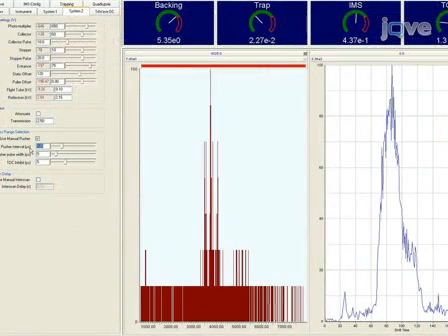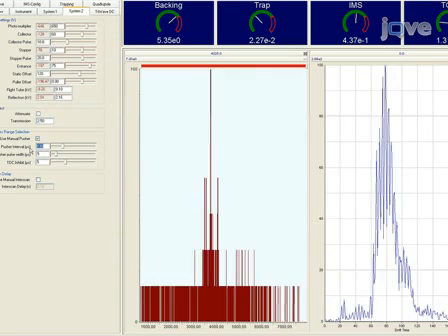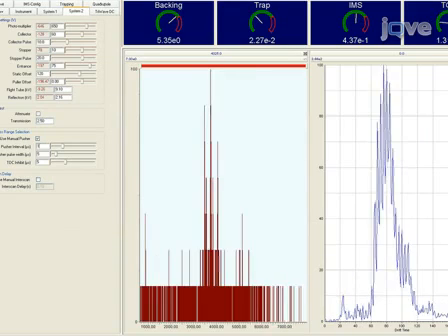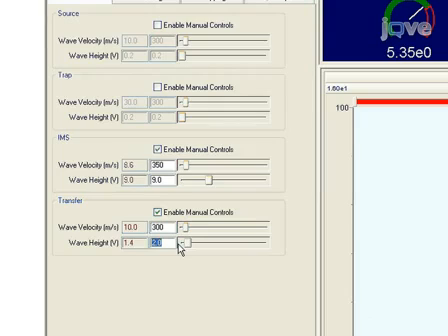Since the pusher frequency is related to the mass range, this artifact may reappear when this parameter is changed. T-wave height exerts a minor effect, though its reduction may also help to eliminate ripples. Once the aforementioned parameters are optimized, the IM-MS data can be acquired.